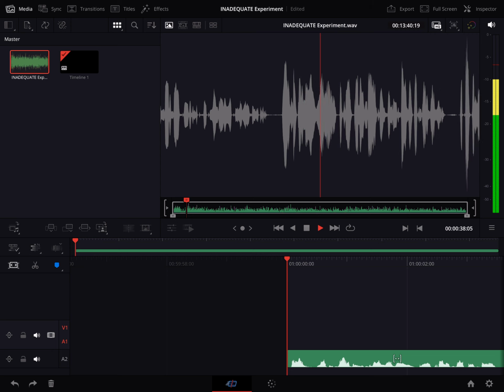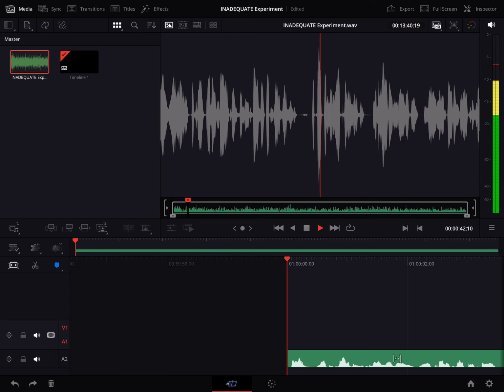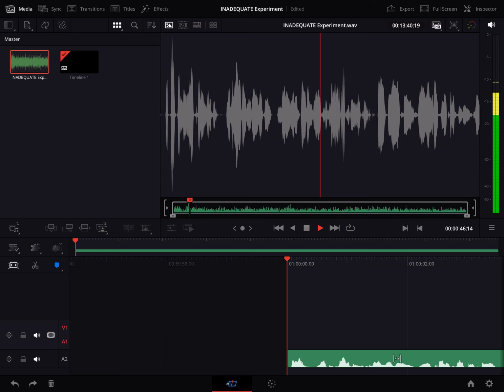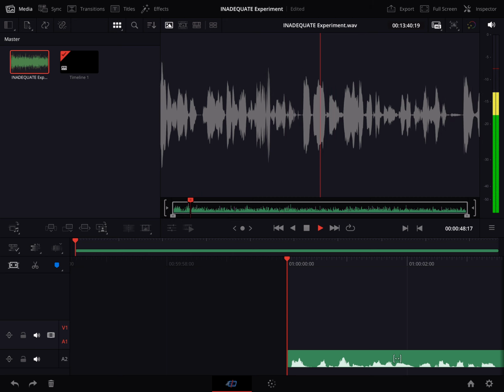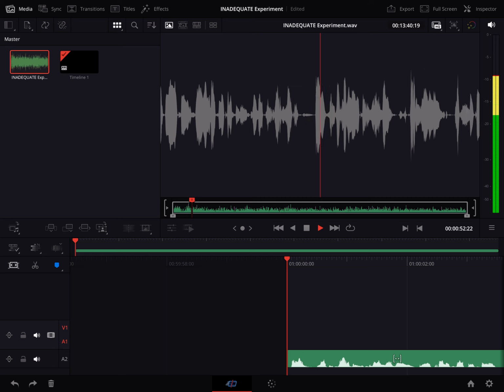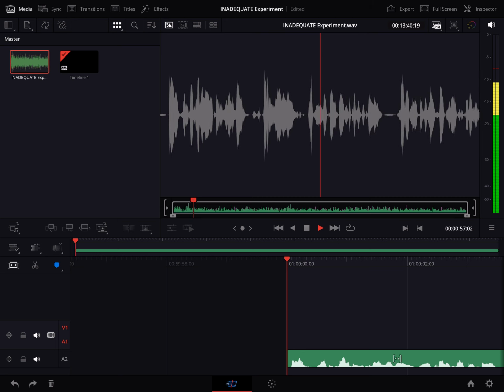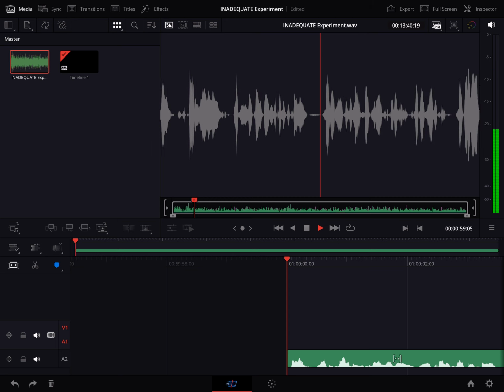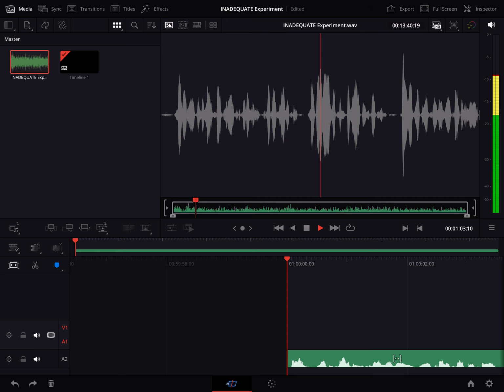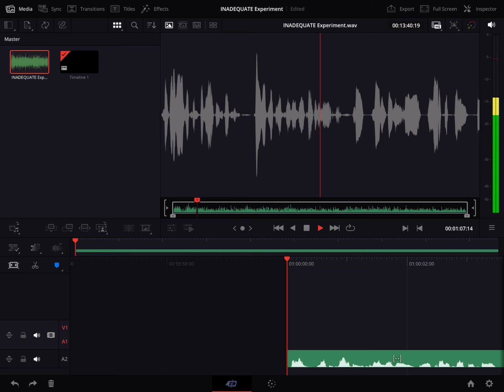Yeah, so NMR in general, it's like giving scientists this incredible X-ray vision, but at the molecular level. It's how they see what these tiny little building blocks of matter actually look like. Right, molecules. I remember that from my chemistry days, way back when. Exactly. And the structure of a molecule, how the atoms are all arranged, that's super important because it determines how that molecule behaves, how it interacts with other molecules. Okay, so that makes sense. So NMR helps us figure out those structures, kind of like making a 3D blueprint of a molecule.